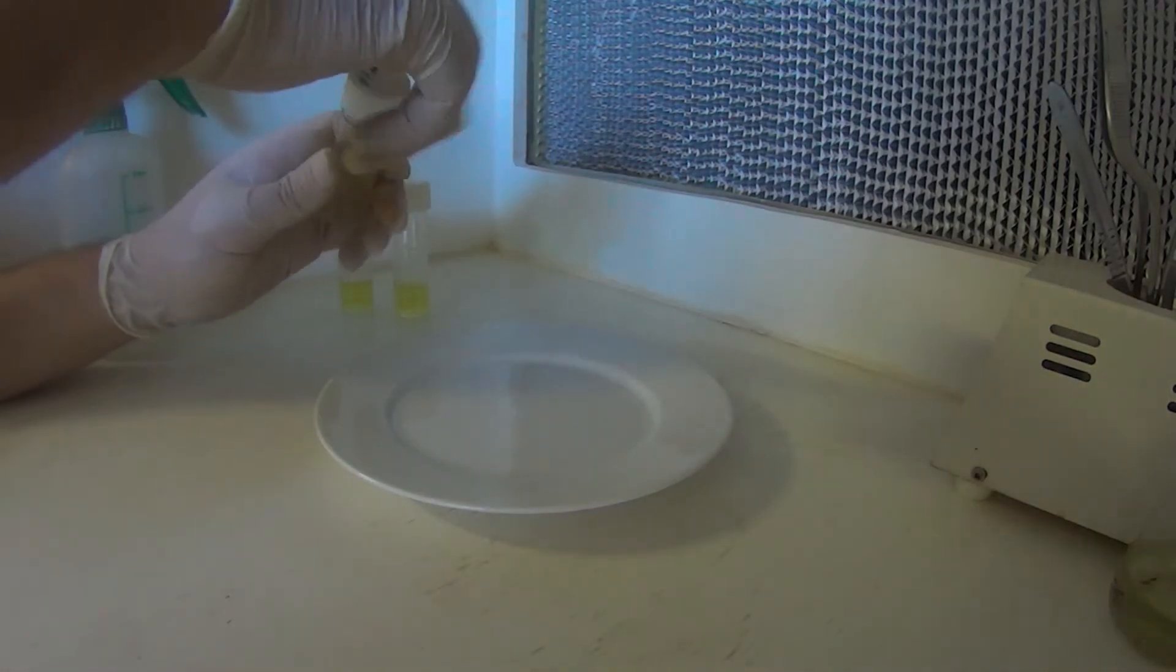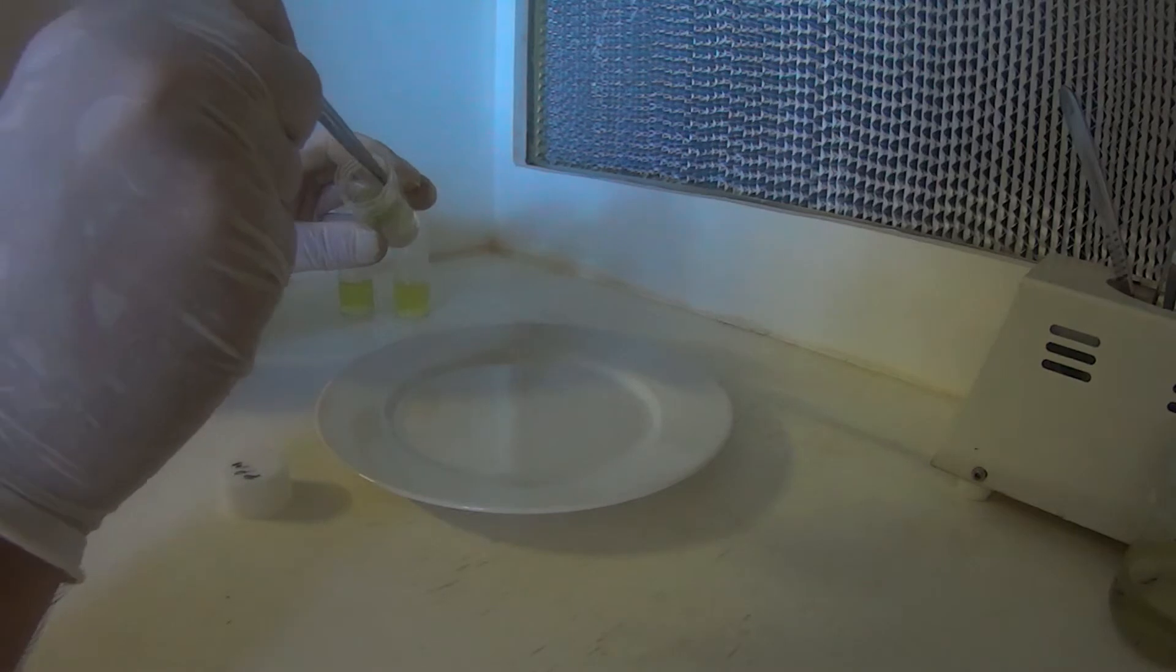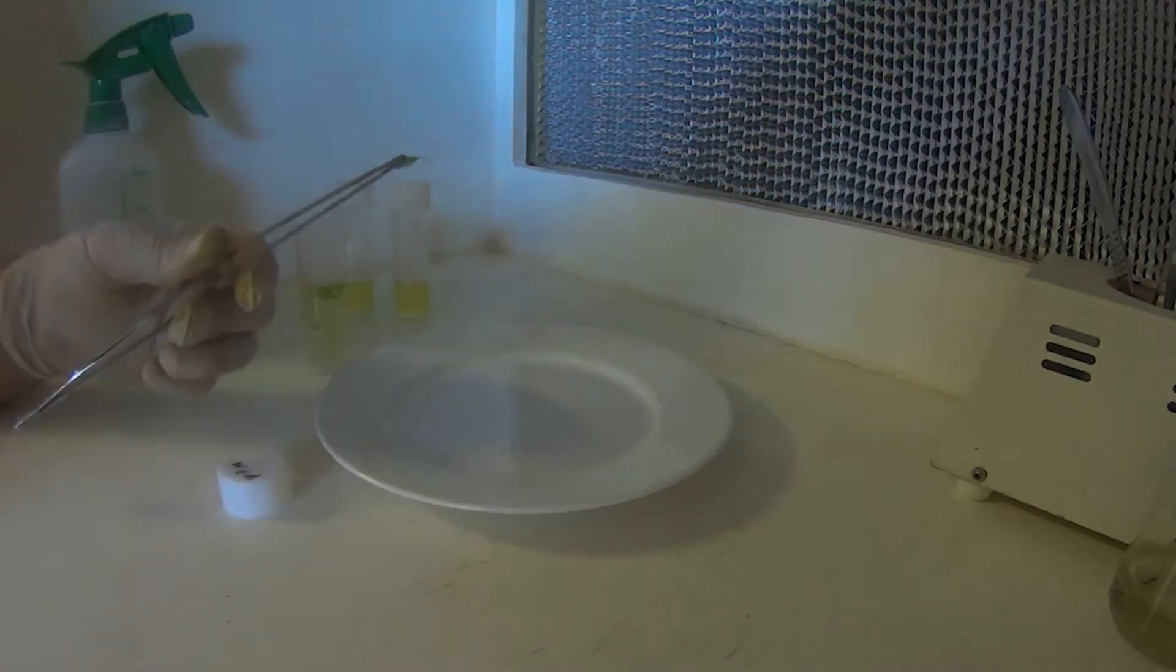So what we'll do, what we did previously, this is the plant preservative mixture in here. 2 mils per 50 mils of MS solution. So what we're going to do is remove one little bit of plant.